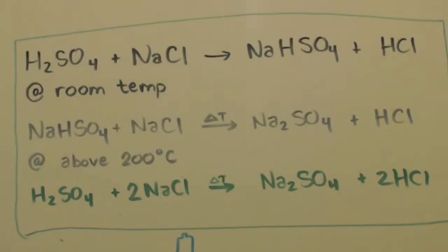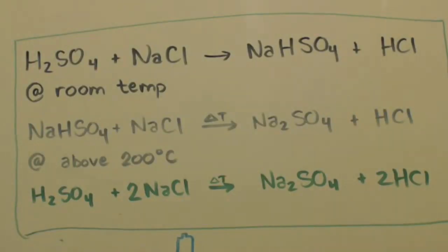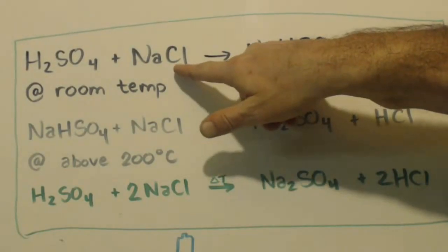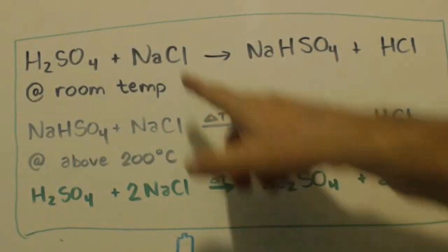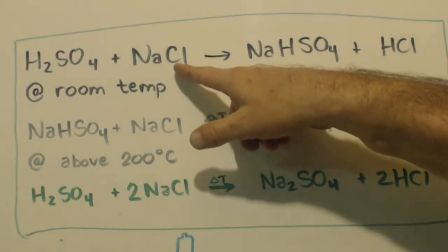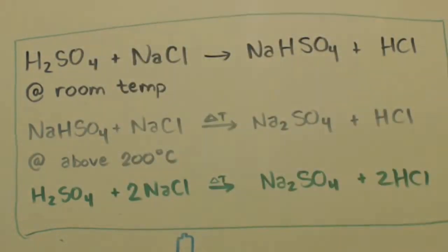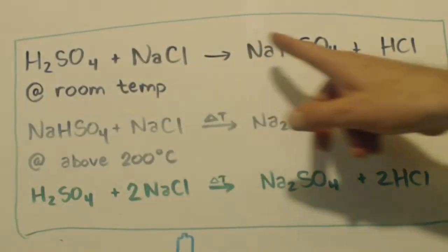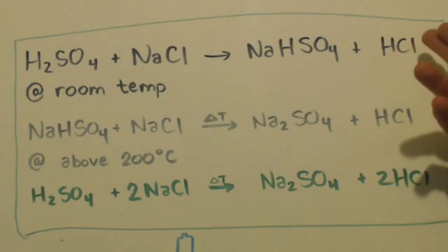Okay. You can see you add them together just like any other acid. You take the salt that has the same anion as your acid, and you drip a stronger acid on it. We want hydrogen chloride, or hydrochloric acid, so we get a chloride salt. Our strong acid is sulfuric acid. It'll make bisulfate and your gas, HCl. Now, this isn't making hydrochloric acid, this is making HCl.